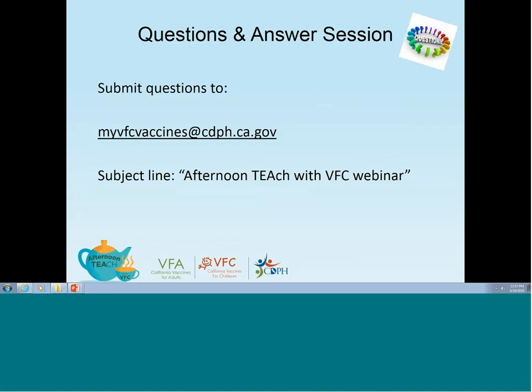All right. So I just want to verify this. For VFA and VFC, if the fridge does go out of range, we do make an excursion report. Is that right? Correct. Okay. I just wanted to clarify that because that's what I was told to do.